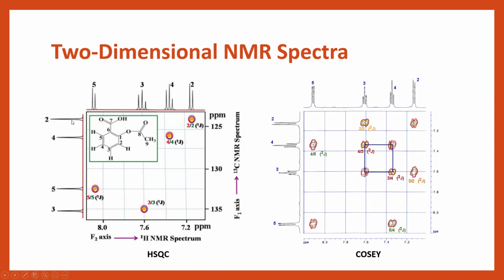And what happens is we have a plot like this, and we can correlate. So this is what you'd be given in your spectrum. You find a peak of interest and go across, and you can say that this peak here correlates to this peak here. So this carbon here is related to this proton here.